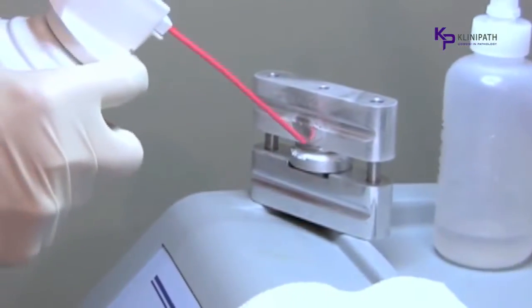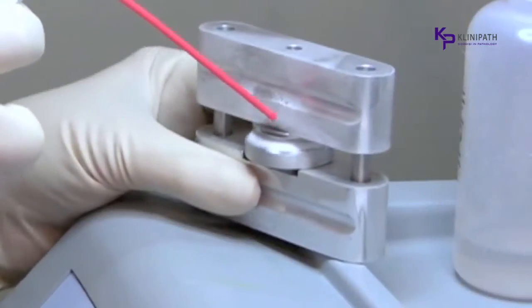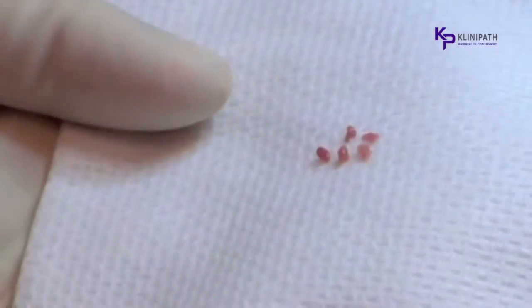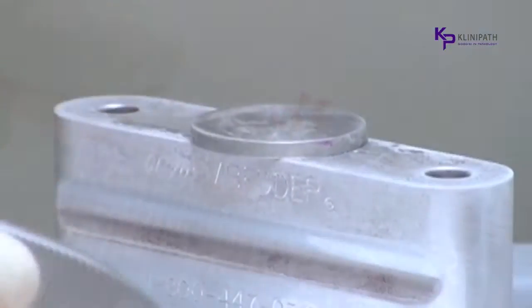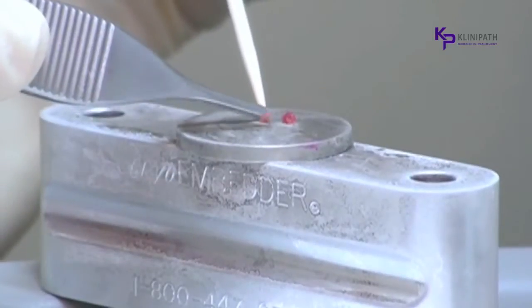Because needle biopsies are rarely inked, they can be difficult to see in the embedding medium. By using the Cryoembedder, there is no guessing where the specimen is in the block. When it is transferred to the cutting chuck and removed from the flat disc, the entire specimen is visible. With a disc that has been cooled, small samples easily stick to the smooth steel and multiple pieces are all on the same plane during the cutting process, instead of floating randomly throughout the block.